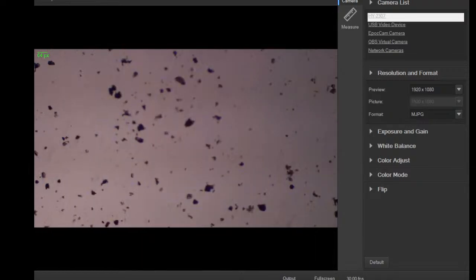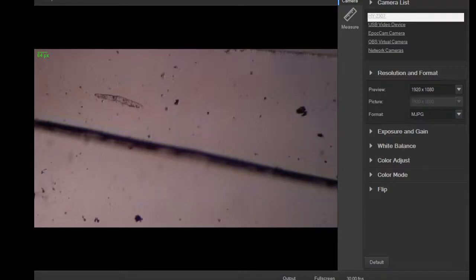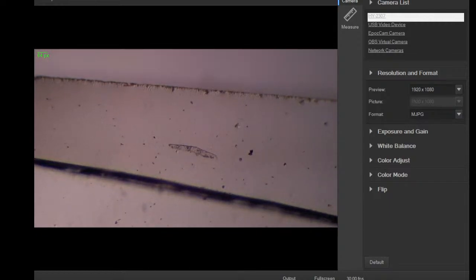Mostly looks the same, but there's a little rush right there. See all the stuff flying by as the osmotic gradient is figuring itself out. Whee!